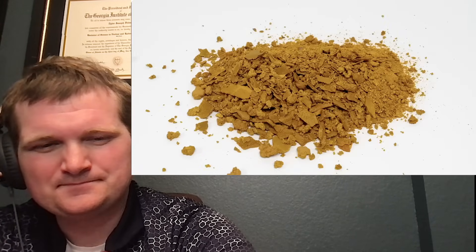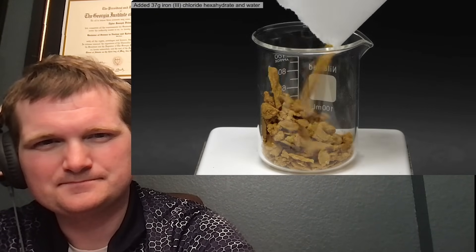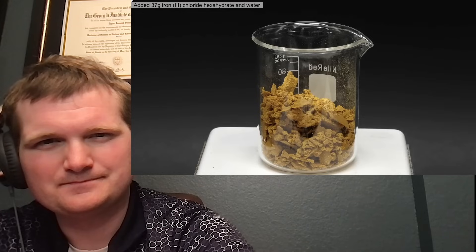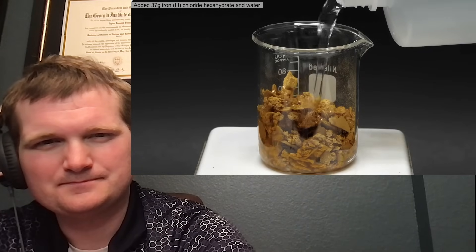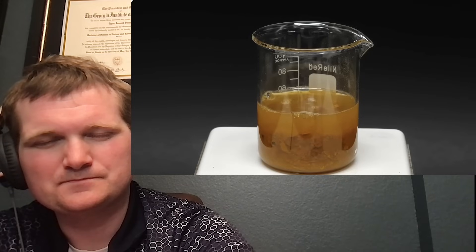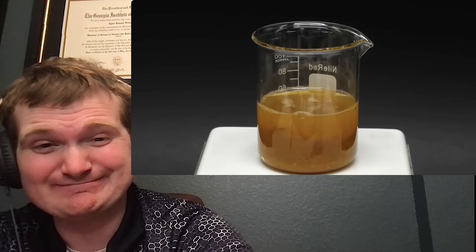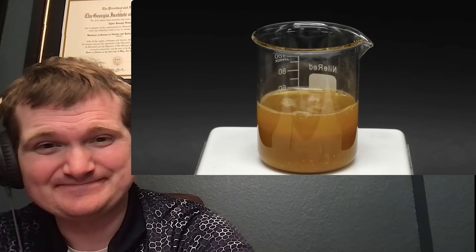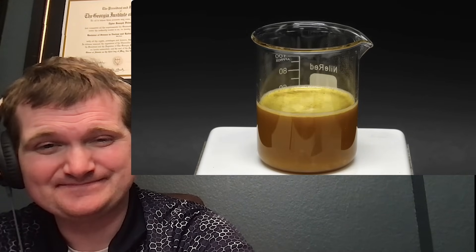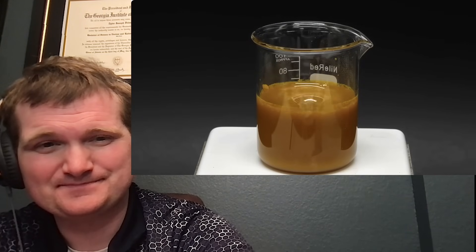I transferred it all to a plastic container, and I was ready to make the Prussian blue. The first step was to remake a solution of the iron-3 chloride. Into a beaker I added 37 grams, and then filled it with water to around the 50 ml mark. In theory, if I were even lazier, I could've just directly used the solution from earlier and skipped the whole evaporation step. The major reason I didn't was because I didn't know the exact concentration of iron-3 chloride.